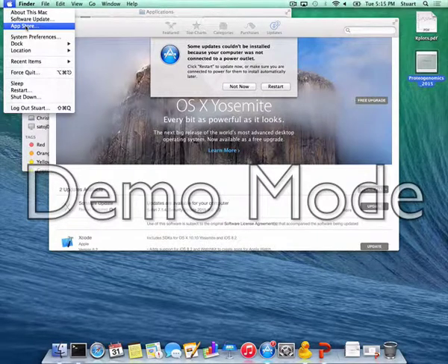Yeah, so that's sort of a different thing. What you normally do to find post-translational modifications, and I think you probably have a whole lecture on this, is in a search tool like X!Tandem, that's an option where you put that in. So you don't have to know that it exists, but you have to know that it could exist, and then in the search it adds those modifications in as possibilities. That's part of the search tool that does that.